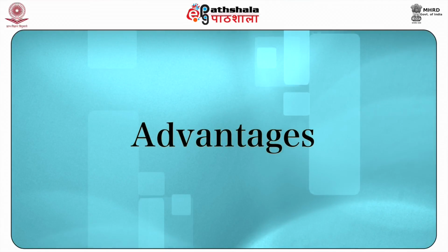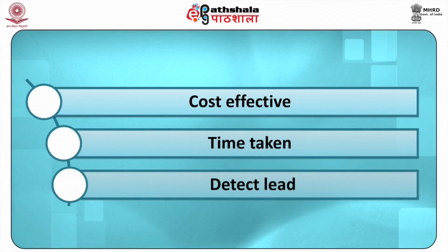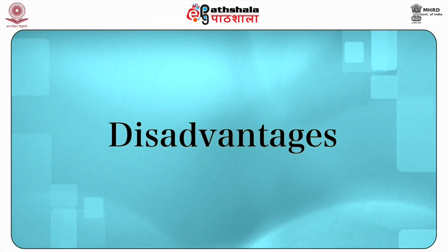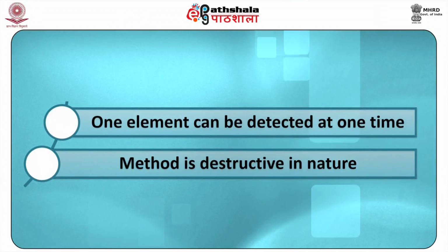Advantages: it is cost effective. Time taken for analysis is reasonably less. It can detect lead also. Disadvantages: only one element can be detected at one time. The method is destructive in nature.